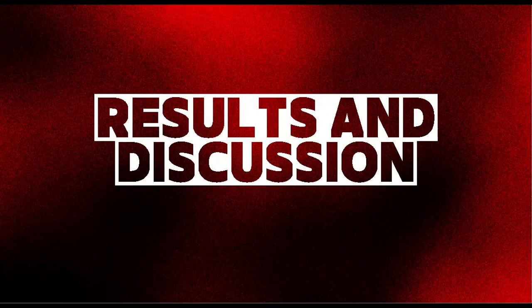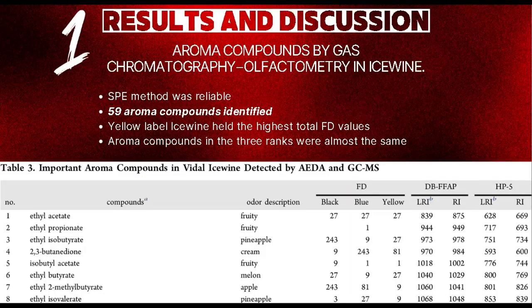Next, we have come to the results and discussion. The first one is the results from aroma compounds by GCO in ice wine. First, we found that the sample extracted by SPE represented exactly the typical ice wine aroma profile. Thus, it was reliable to be used to analyze the ice wine key aroma compounds. A total of 59 aroma compounds were recorded by the GCO. The yellow label ice wine held the highest total of FD values among the 3 ranks.